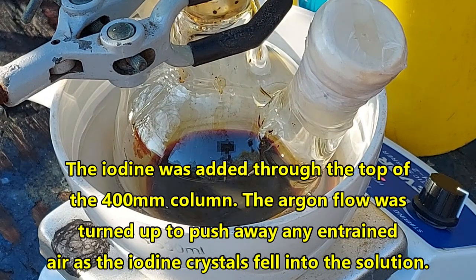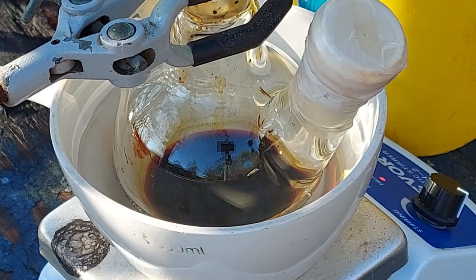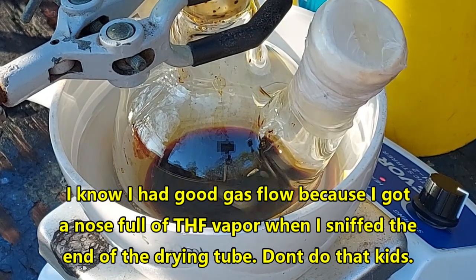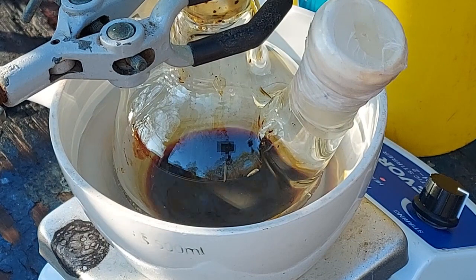Yep, it's in there all right. Let's get that away from the condenser — it's still looking good. Yes, everything's looking good. We've still got flow, it's stirring, it's heating.